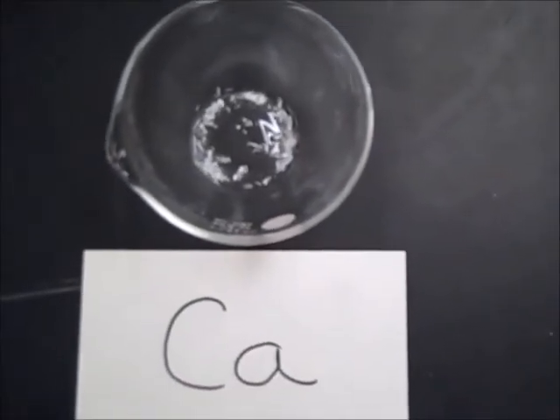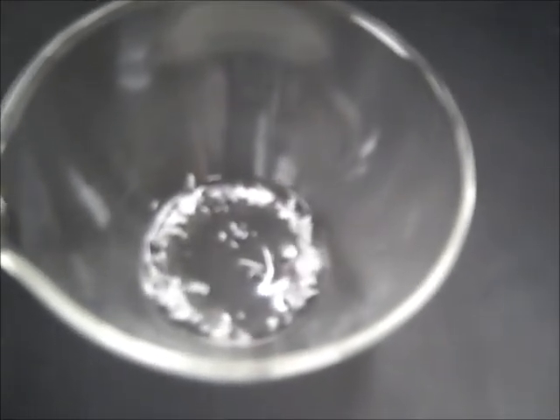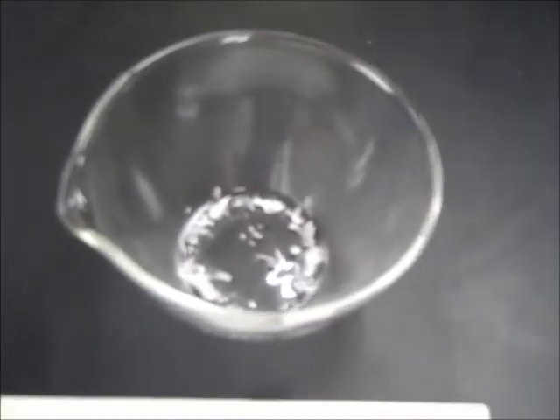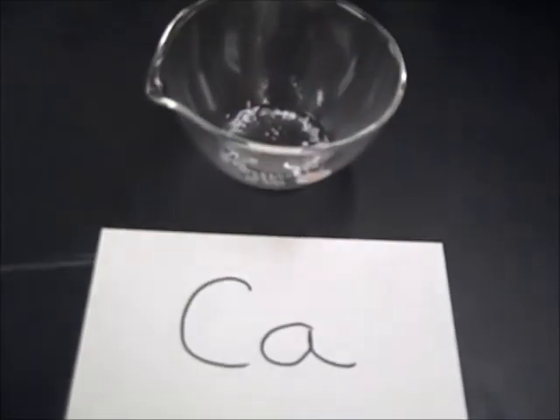Look at him, he's loving adding all that acid in there. You have to. Some better reactions out of it. Okay, we are getting fumes coming up out of it. It's reacting, it's bubbling. Well, I can smell that one, definitely. My sinuses are now cleared out. Oh yeah, some foaming. Can you hear that too? Not as loud as the magnesium was. Heat. Look at that. And even our camera woman has discovered heat. Definitely good signs of a chemical reaction.